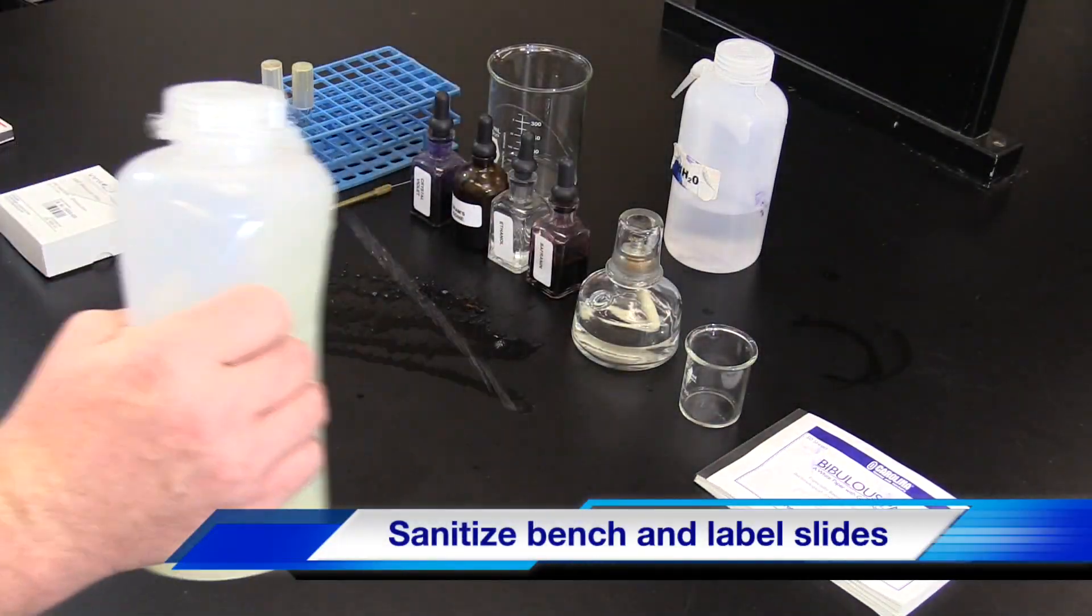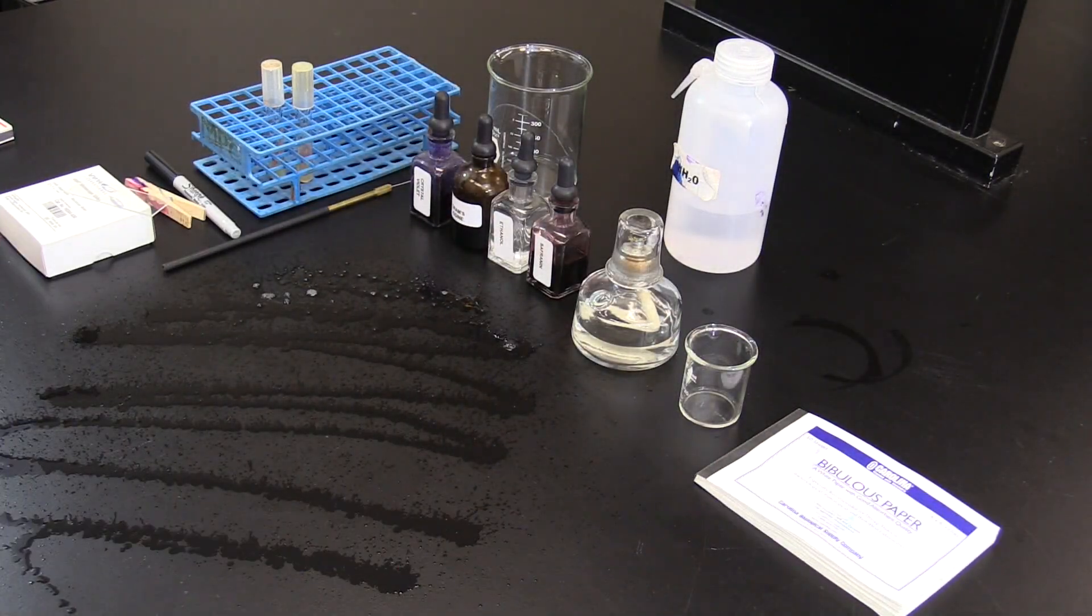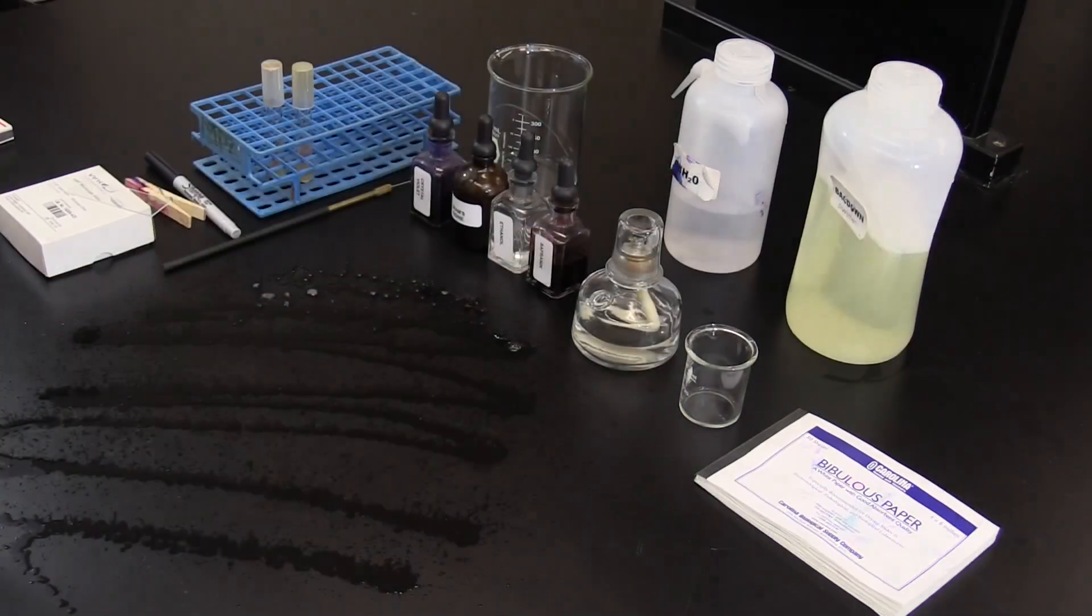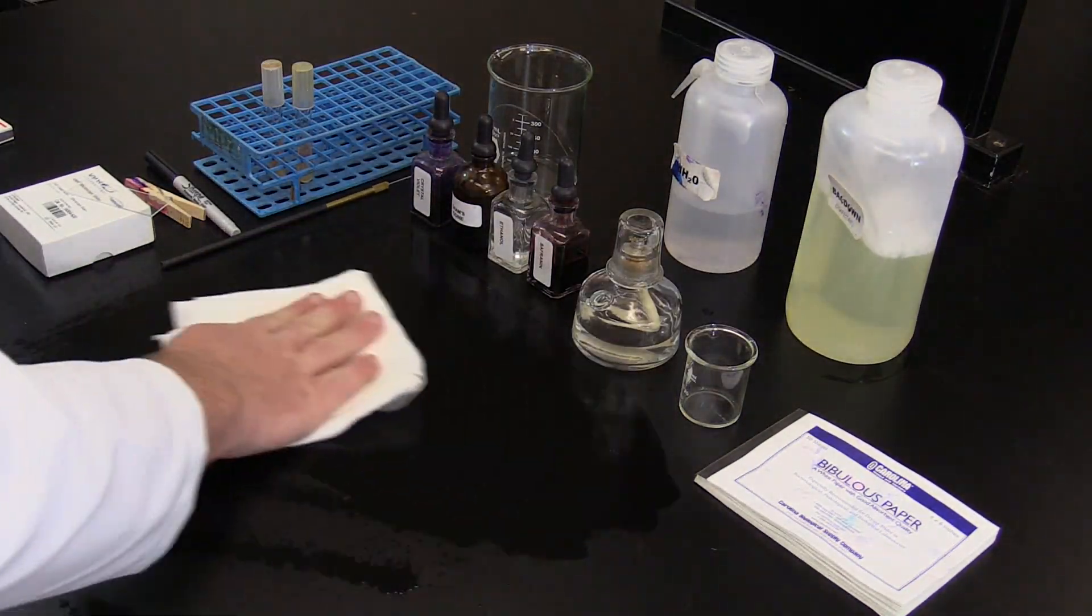To begin, sanitize the bench. Cleaning the workspace is essential when working with microbes to retain sterile conditions.